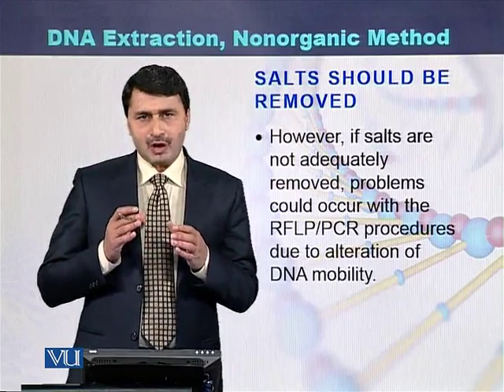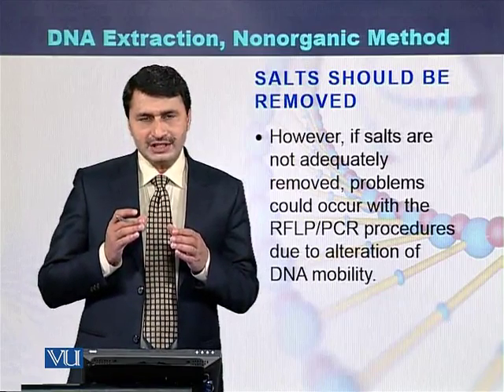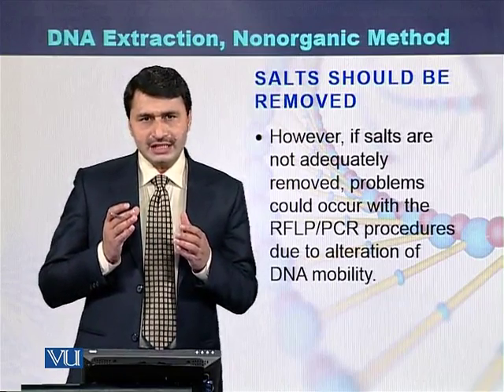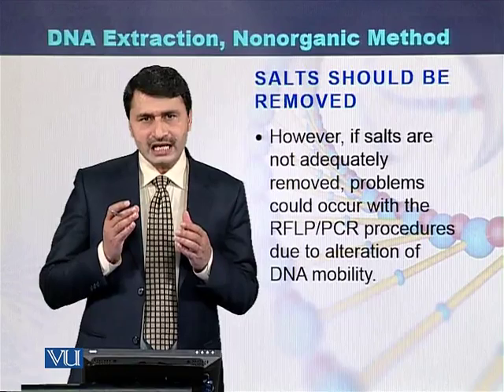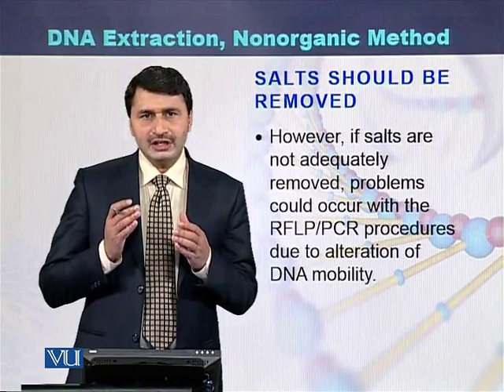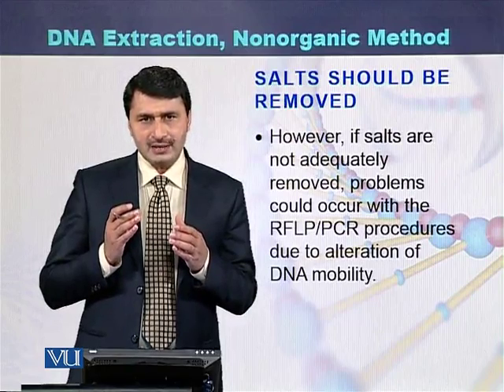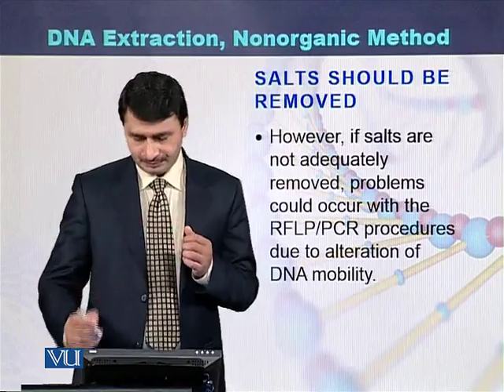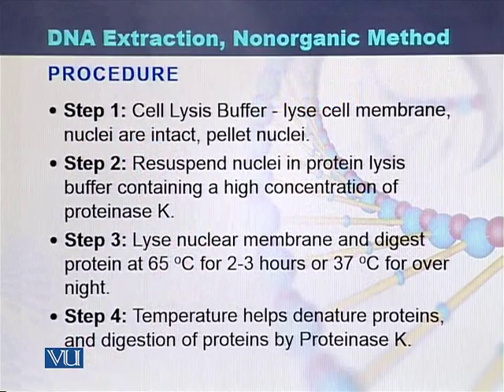But there are some problems with this type of DNA extraction. If amounts of the salts are left with the DNA, they would create difficulty for running PCR as well as for performing RFLPs. Here is the procedure of how DNA is extracted with the help of the non-organic method.